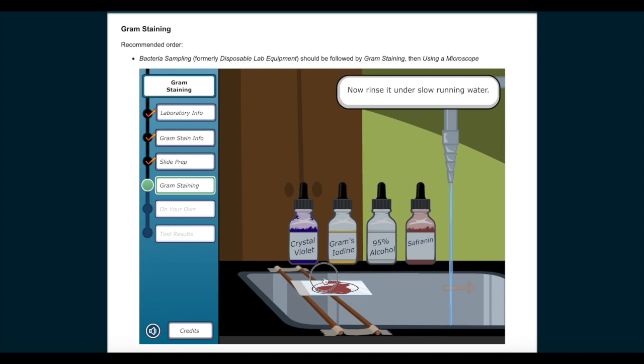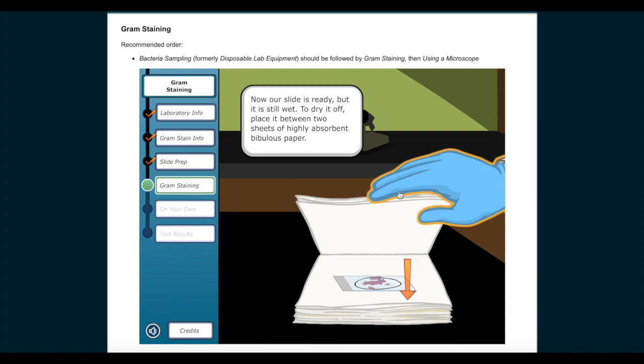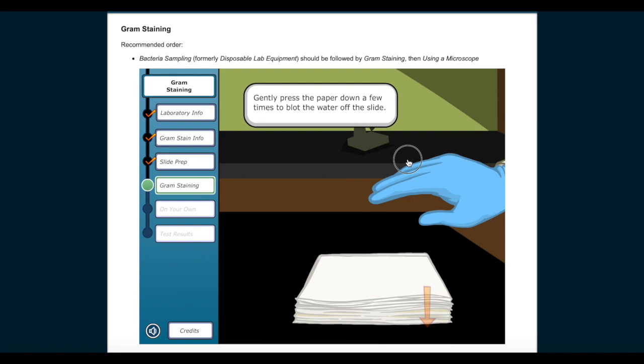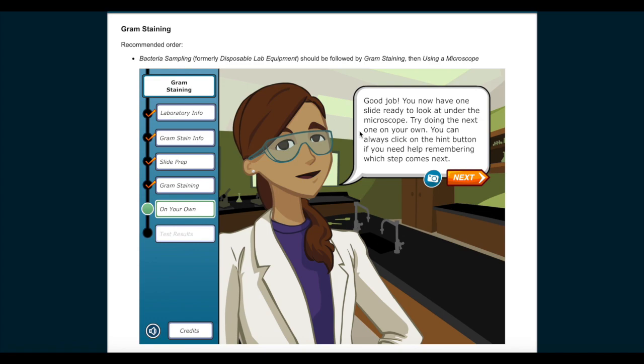Now our slide is ready, but it is still wet. To dry it off, place it between two sheets of highly absorbent bibulous paper. Gently press the paper down a few times to blot the water off the slide. Good job! You now have one slide ready to look at under the microscope. Try doing the next one on your own. You can always click on the hint button if you need help remembering which step comes next.